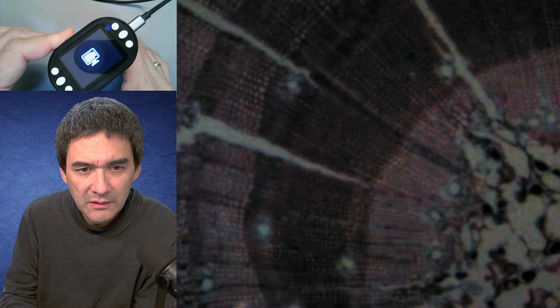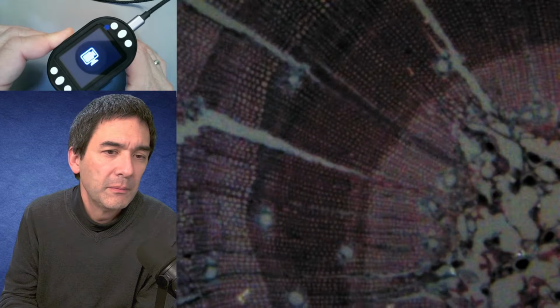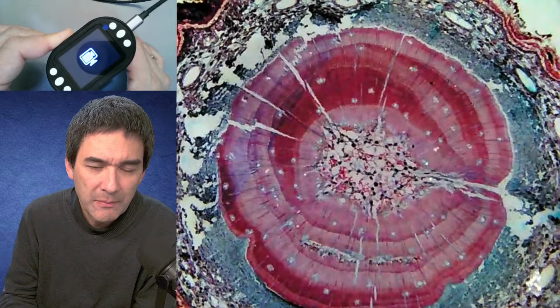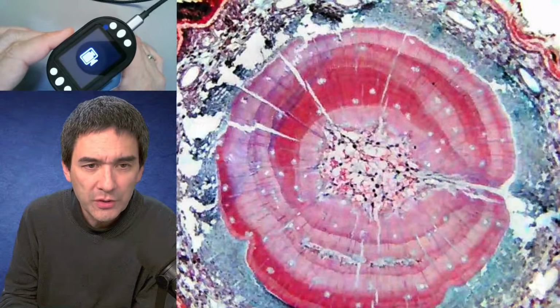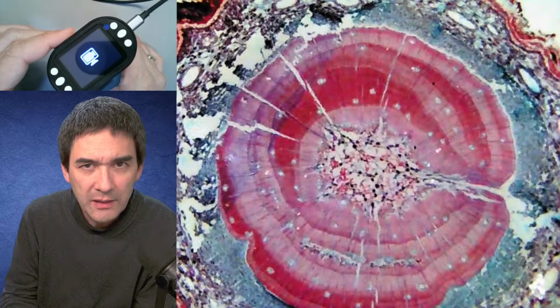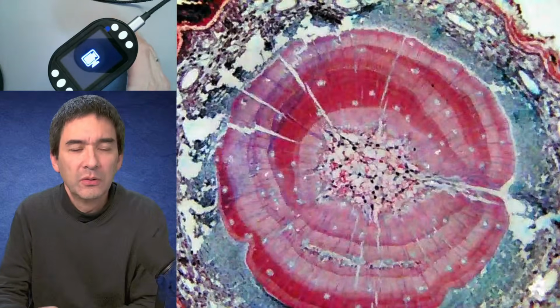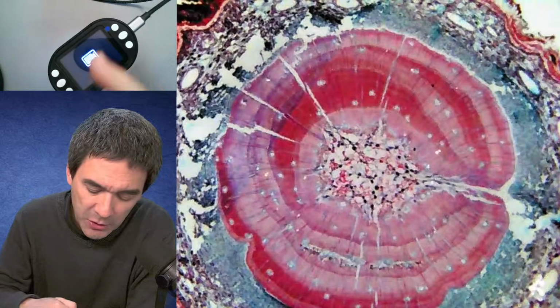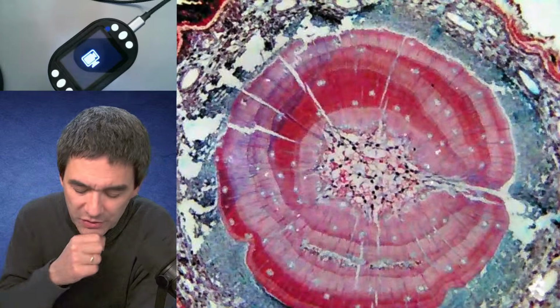Because I'm a teacher, obviously, I've been thinking to what extent these type of devices are suitable for classroom use, for quick observation, and maybe especially for younger students. So that you have a lesson where you give them a couple of slides to look at and maybe their own hair or whatever. And for that, I think it is okay, especially because you're also then able to see it over here on the screen.